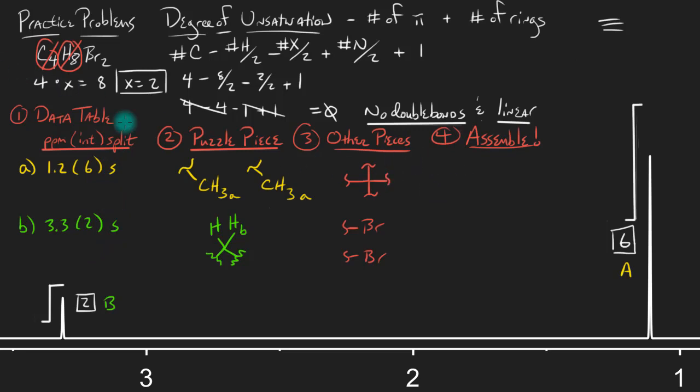So one possibility that we're going to try to discount right from the get-go, something that's very tempting, is we're going to take one of these methyl groups, so this is the methyl group right here, and we're going to try to put it right next to these 2 different hydrogens, so something like this. So this is the hydrogen peak set B, and this is hydrogen peak set A. So you could take the yellow peak set right here and put it right beside the green.